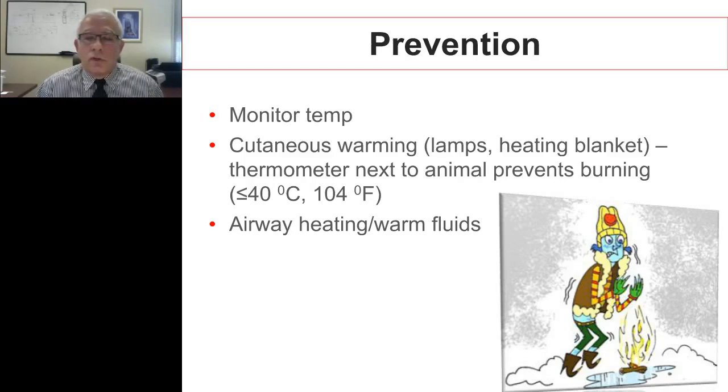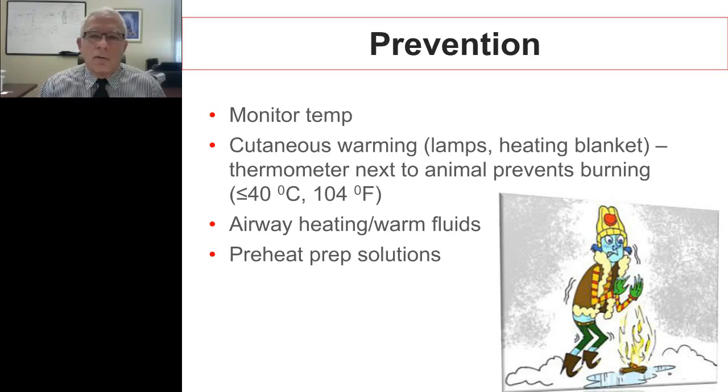Why not submerge the hoses that go from your vaporizer to the mask and just immerse them in warm water? Maybe you can heat up the fluids that way. Warm fluids, don't forget to warm them up. Don't give them cold fluids if they need fluids. And preheat your prep solutions. Why not put your betadine and your chlorhexidine in the microwave before you use it on the animals? And of course, none of us are going to be putting our animals on a cold stainless steel table.